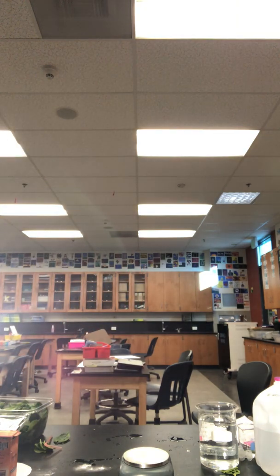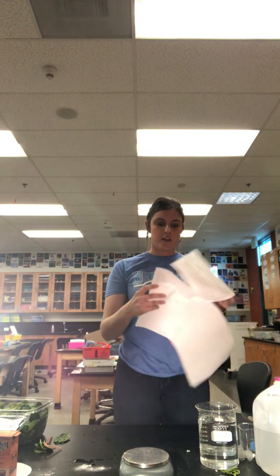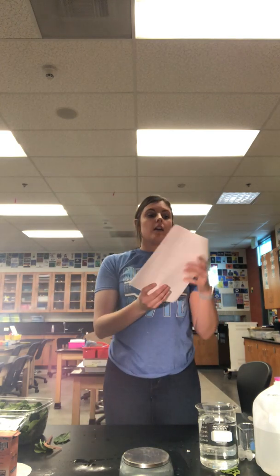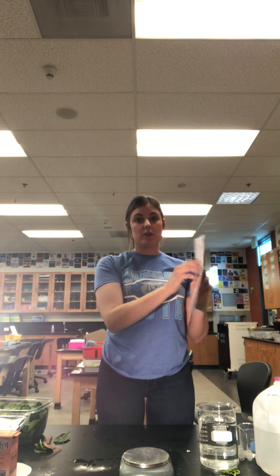And so we will be taking data for 15 minutes, every minute. Immediately after setting our beaker under the light, we're going to start our timer, which I have set to the side. And when that timer hits 1 minute, I'm going to record how many chads have floated to the top. I'm going to do that every minute for 15 minutes with an ongoing score.